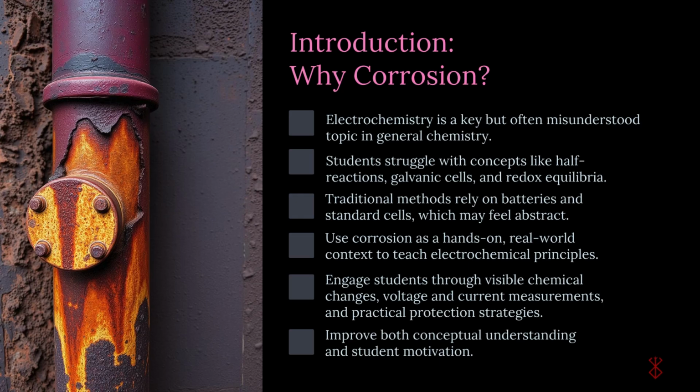The authors designed a hands-on laboratory experiment that allowed first-year undergraduate students to explore corrosion directly. Students observe electrochemical reactions in real time, measure voltage, current, and mass loss, and investigate different methods of corrosion protection, including sacrificial anodes and impressed current cathodic protection.